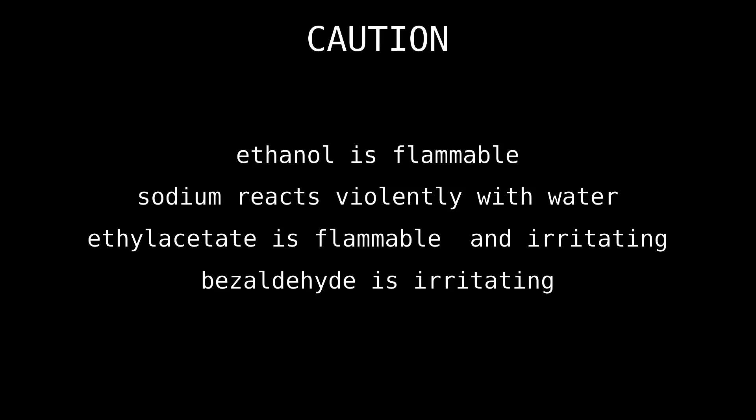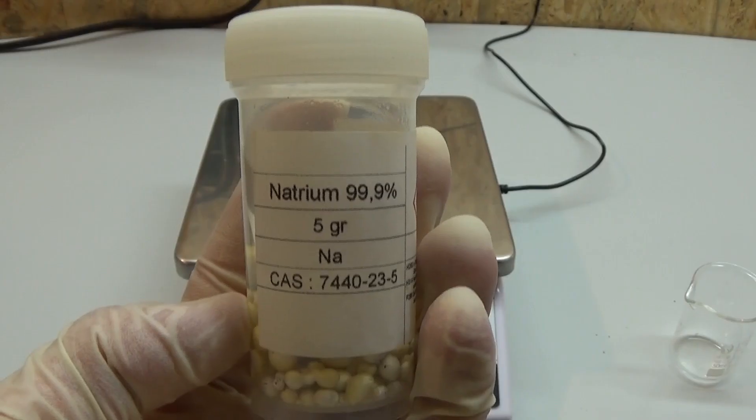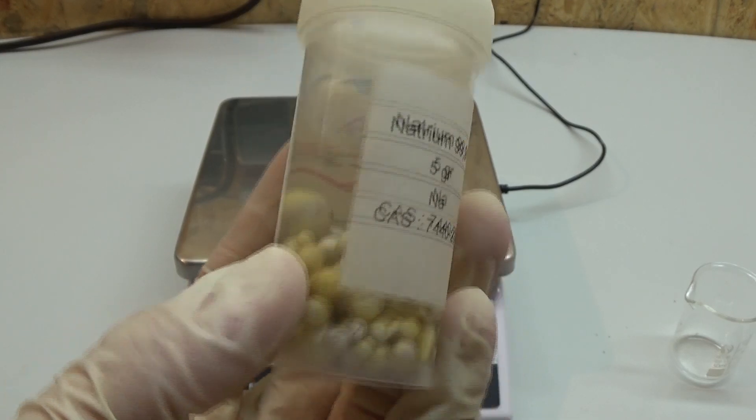Hello you all. In this video we will do the first step of two in the synthesis of trans-cinnamic acid. This will be done via the Claisen condensation using sodium ethanolate as catalyst.